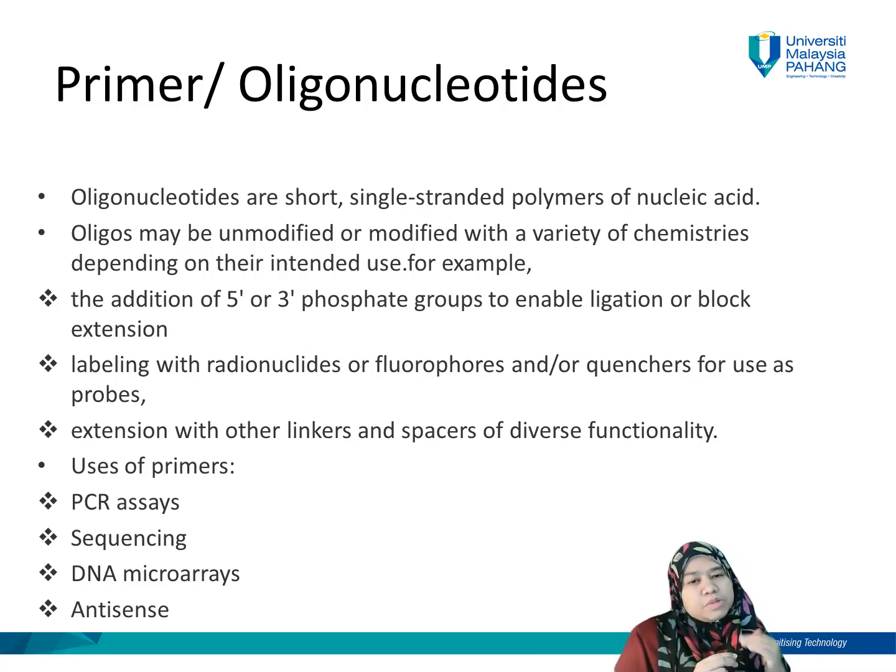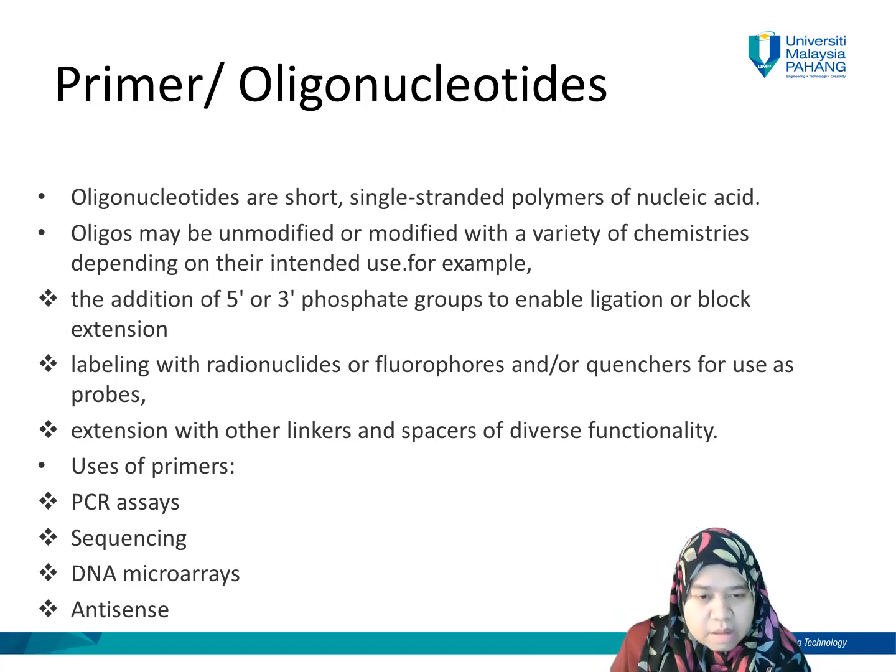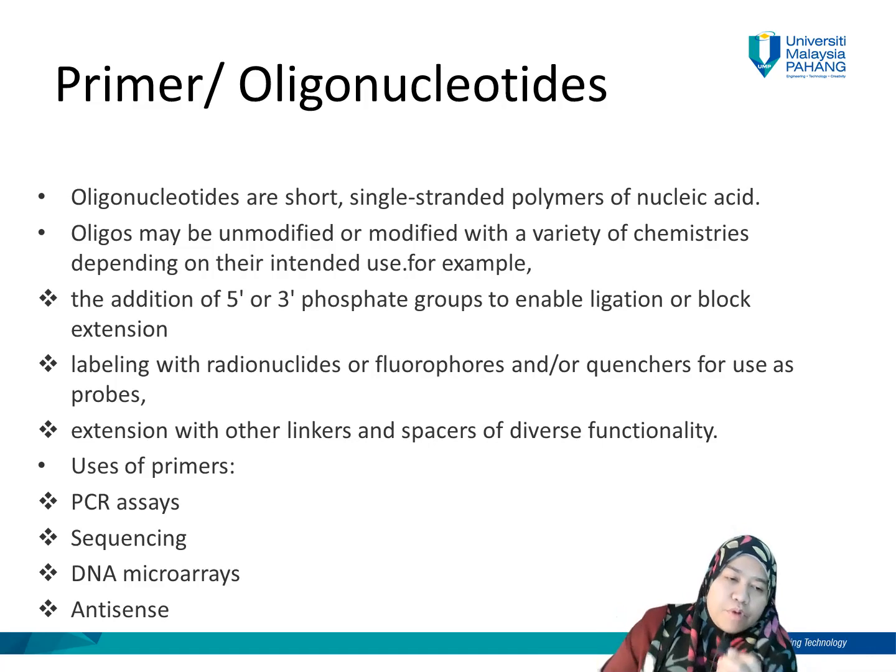Okay, if you want to have an extra function for the gene that you express, you can link the primer, the starting primer, with a tag, for easier downstream processing. For example, you may put a His tag at the end of the primer so that you can detect your protein for purification using the His tag.